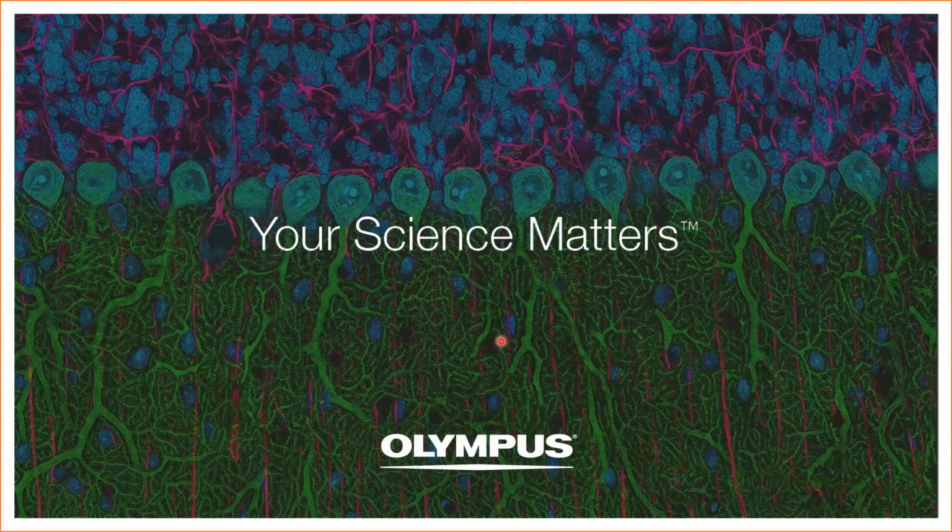Very well. So with the X-Clarity system, all clearing methods will impact your sample size and structure. With the clarity-based methods or most aqueous-based methods, you will get some increase in sample volume size. This will certainly be noticeable after you clear. And if you think back to some of the 3-panel images we always show before clearing, after clearing, and then after final index matching. With the final index matching, the samples will come back down in size, maybe not to what they were before you actually started clearing, but they will reduce back down in size.